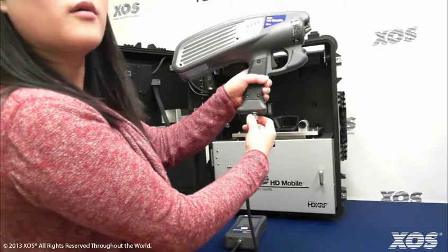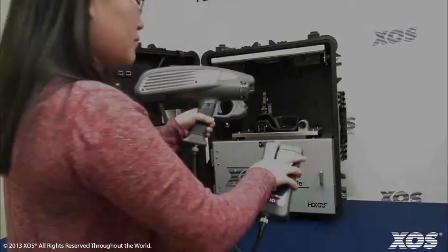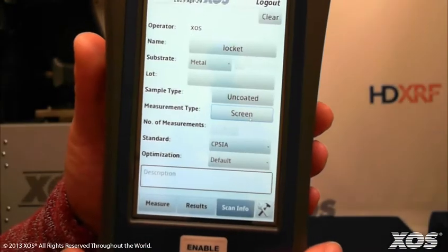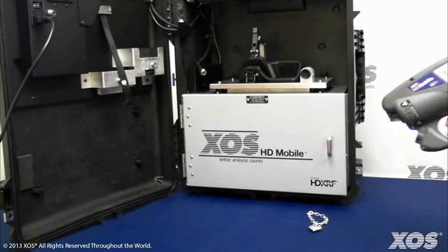Press the power button on the HIM to start the instrument, and once again sign in with the secure username and password and enter your sample information as before. The instrument will automatically detect that it's being used outside of the case and will default to the measurement type for screening.